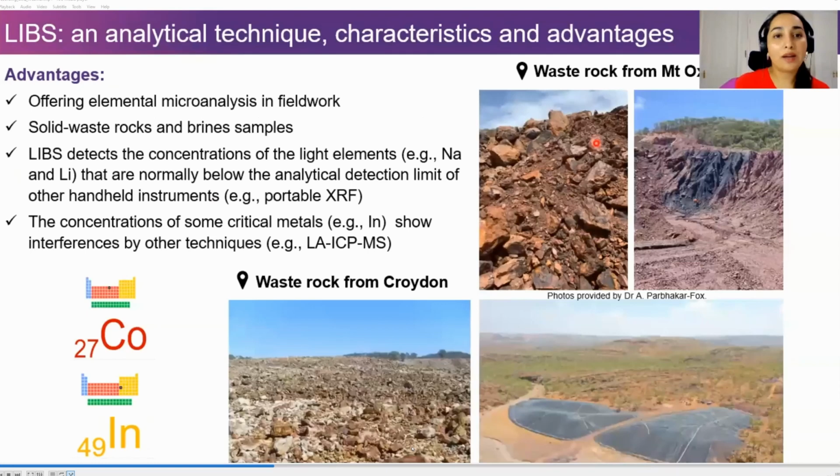Another advantage, which may be obvious, is that this instrument offers elemental microanalysis in fieldwork, because it's portable and the results are obtained very fast, in a couple of minutes. You don't need to prepare your sample in most cases, in comparison to other analytical tools which use sparks or flames, where you need to prepare your sample. The laser generates plasma, so in most cases you don't need to prepare your sample. If you need to use a tailings sample, maybe you need drying and some sample preparation.